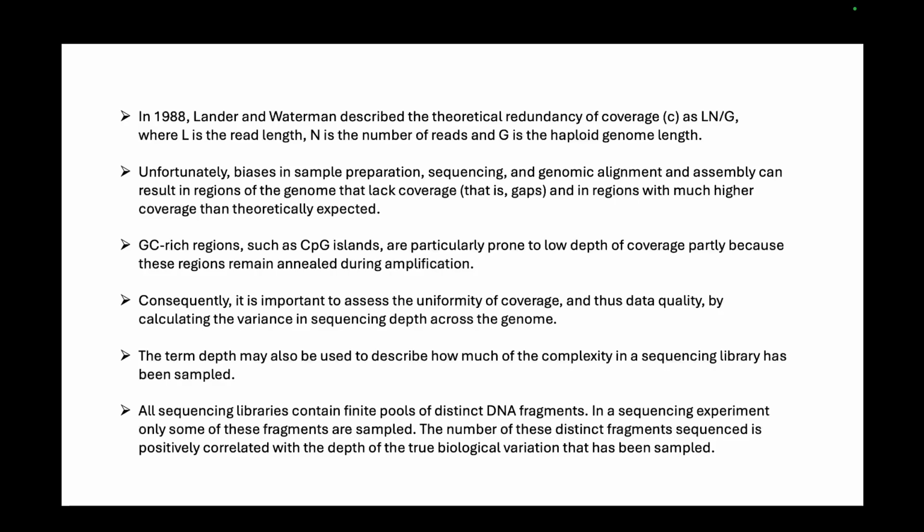A single stranded DNA will form into a double stranded DNA because GC are very attracted to each other, forming triple hydrogen bonds, and those are very strong bonds. So when you are doing amplification using PCR during sequencing, those parts of the region which have high GC content will not be amplified that much, because the single strand will not be there; it will come back and bind on itself, forming a double strand.